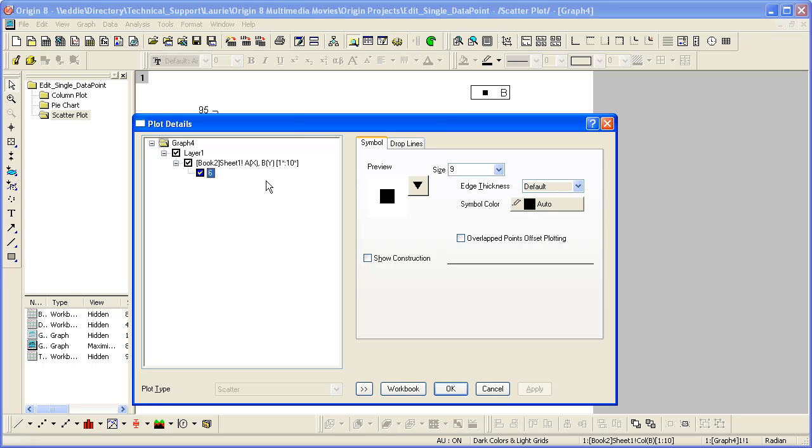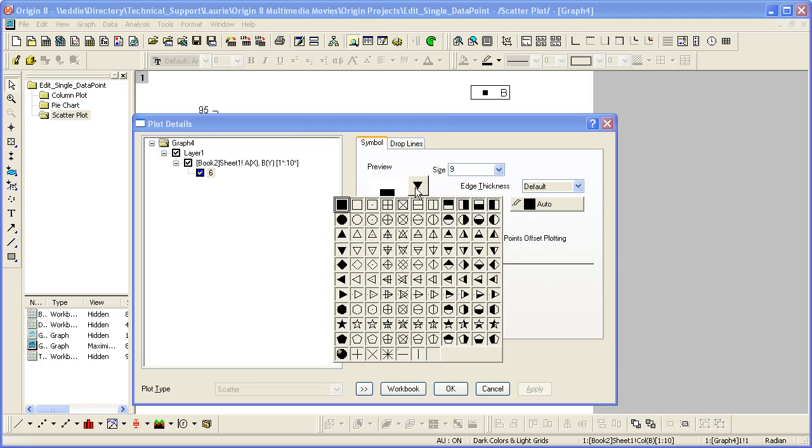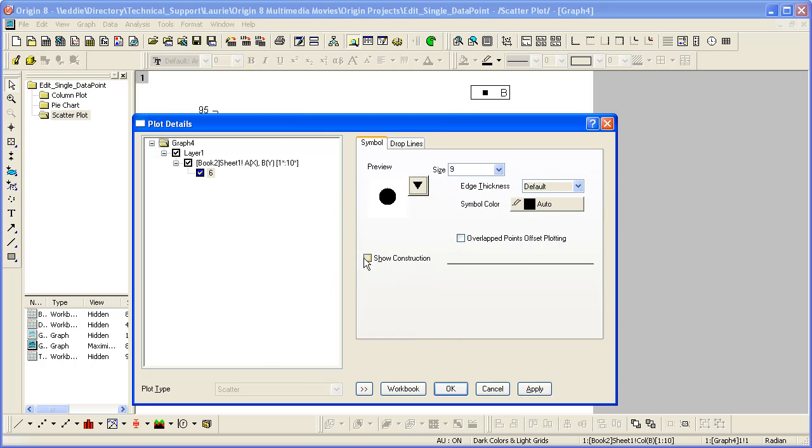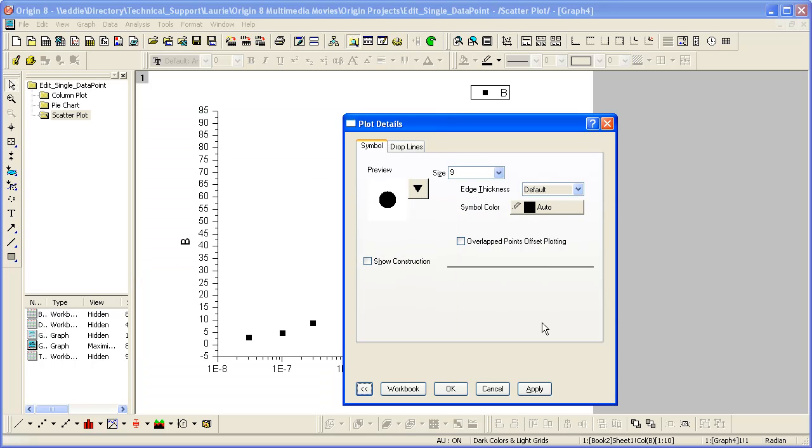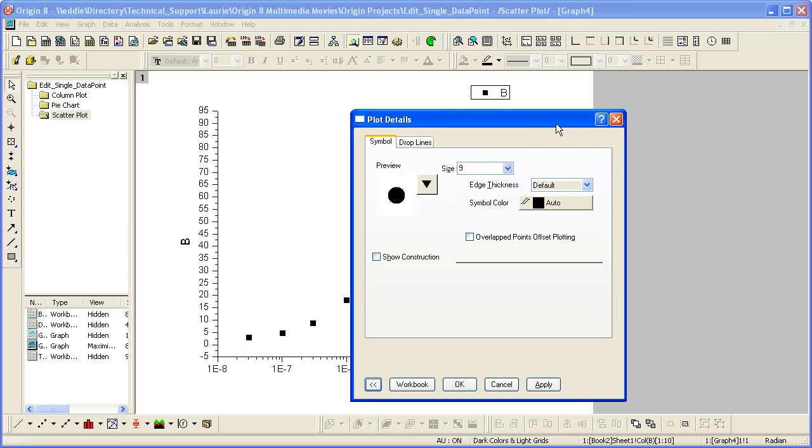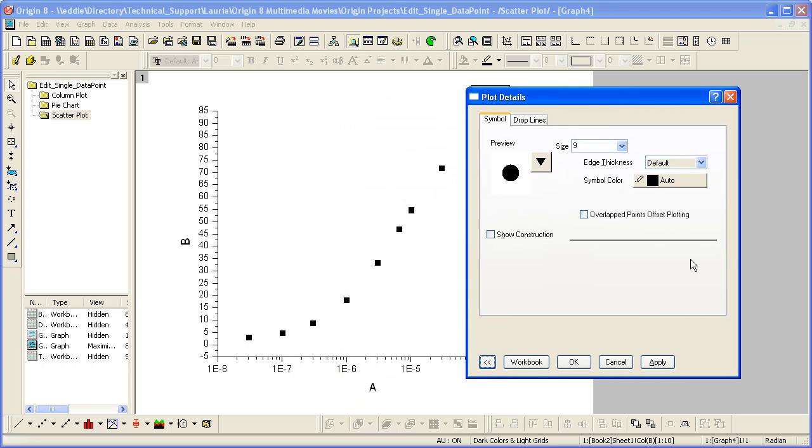Let me set the symbol for this point to circle. We can increase the size.